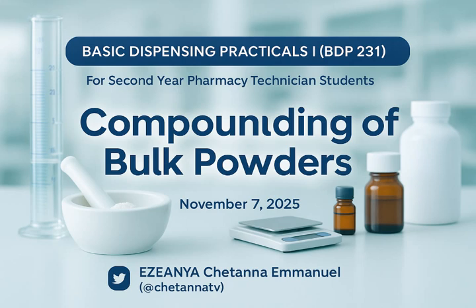Is that clear? So, in order to mix well, you use what is called what? Geometric what? Dilution, or doubling up. Doubling up or geometric what? Dilution.